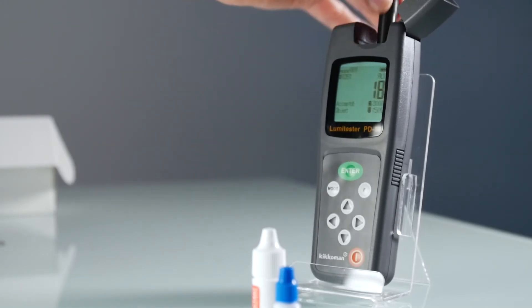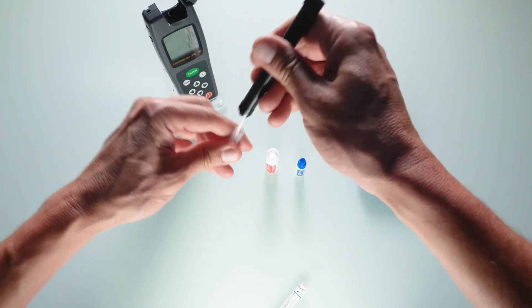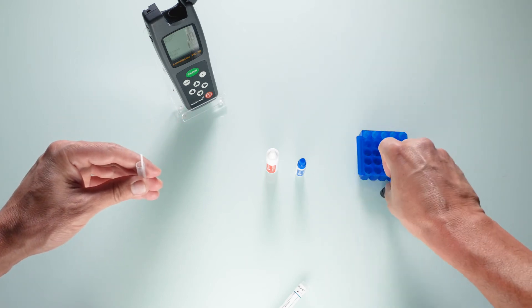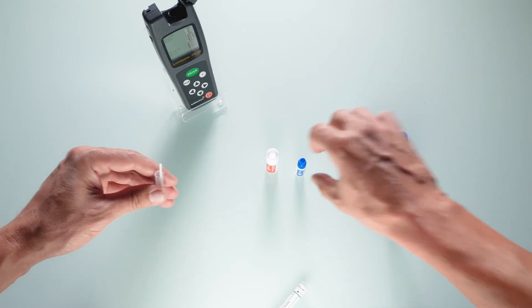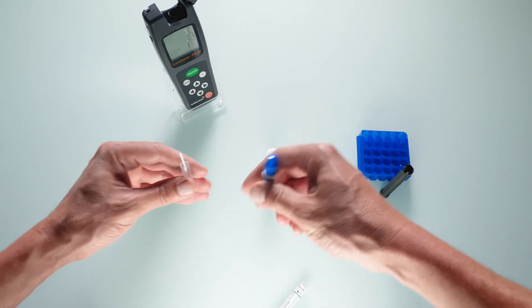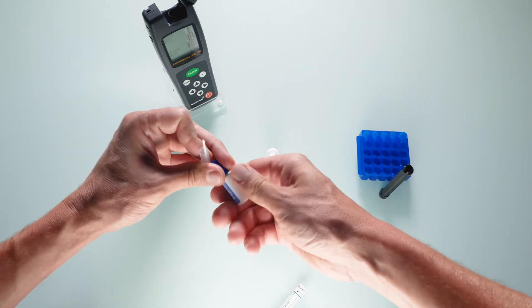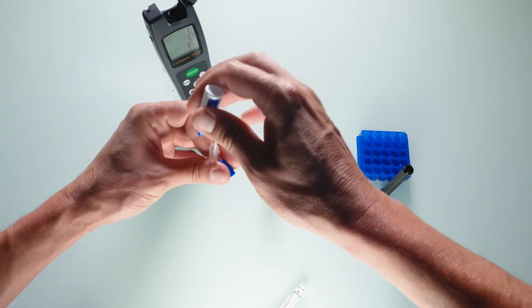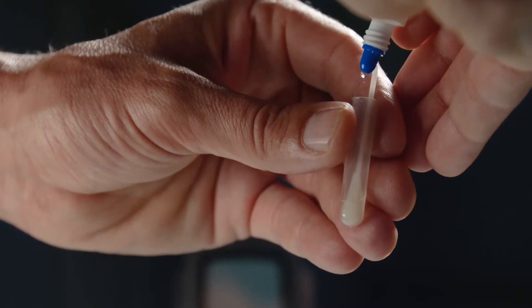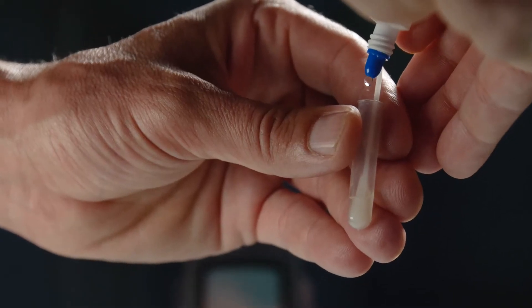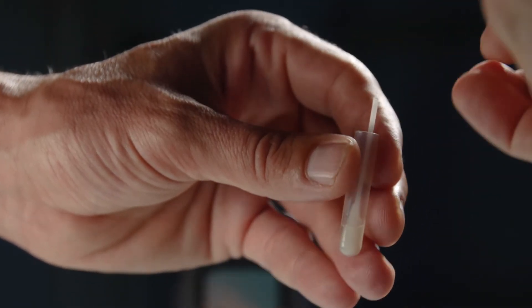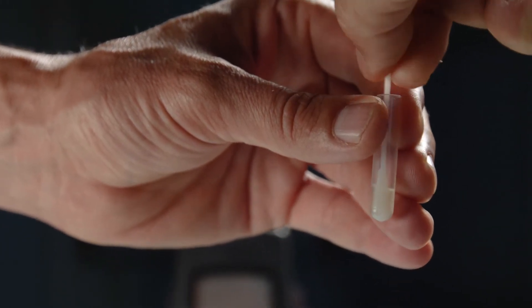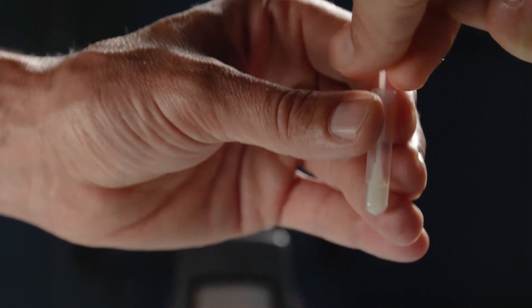Open the lid and take out the LumiTube. Add just one drop of standard into the tube, being careful not to insert the tip of the dropper bottle into the LumiTube. Correctly homogenize the mix by turning the swab inside the LumiTube.